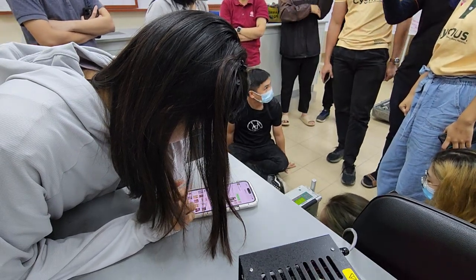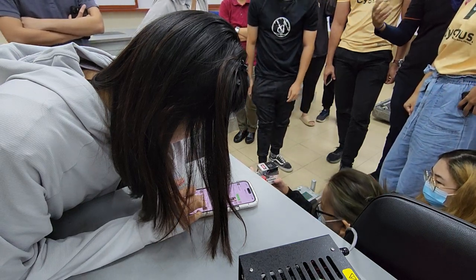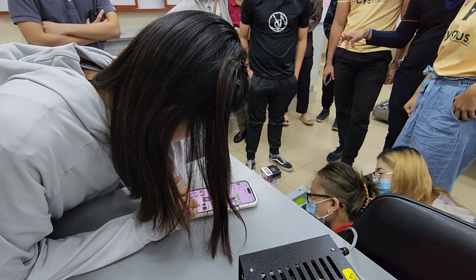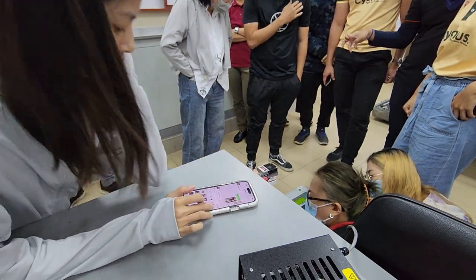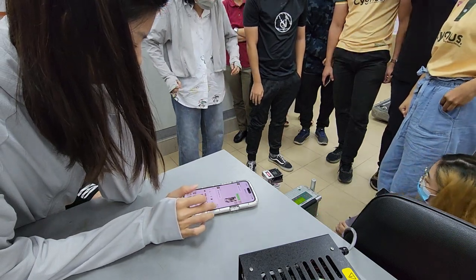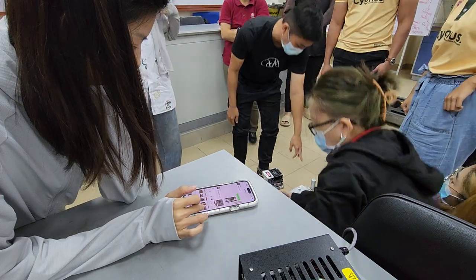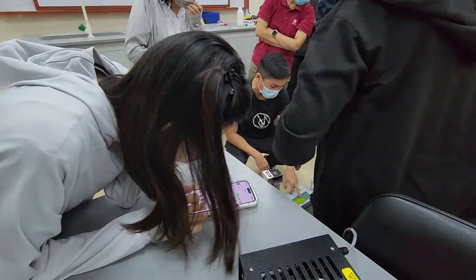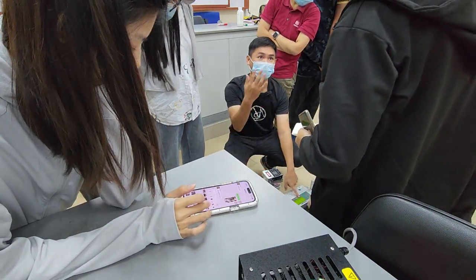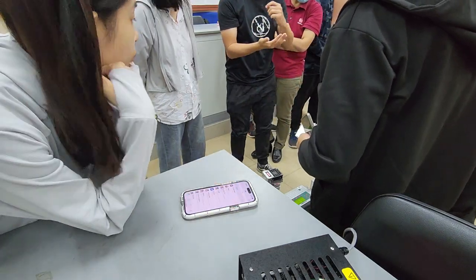You can get some plants from outside. There are so many plants outside, go outside, get your plant. Just make sure you know which plant belongs to which log number. Before you take the data, make sure you know the log number, because after you export the data, it won't tell you which leaf log one represents. So it's better to have a data sheet.